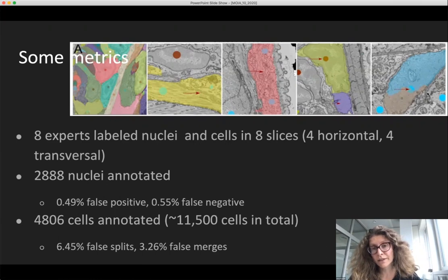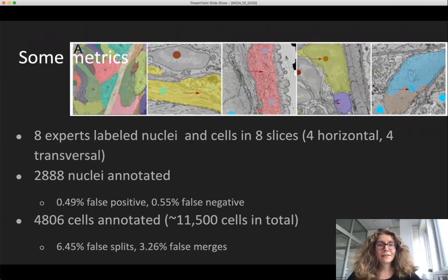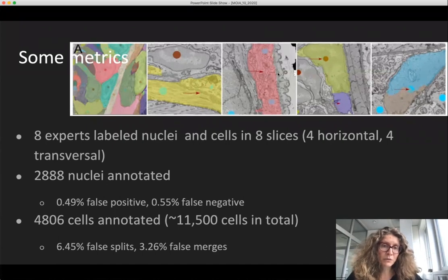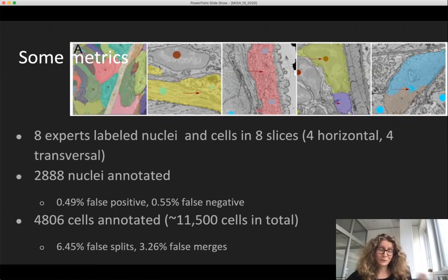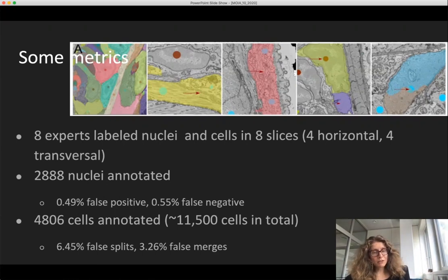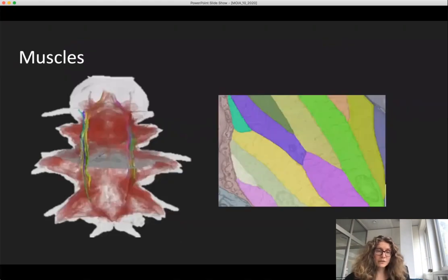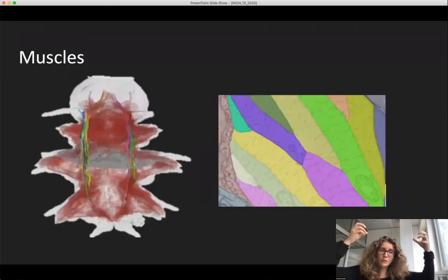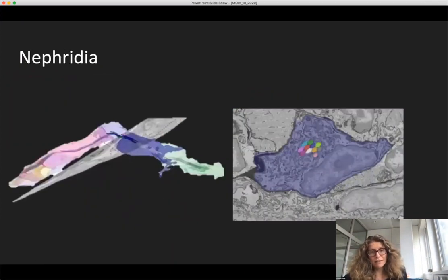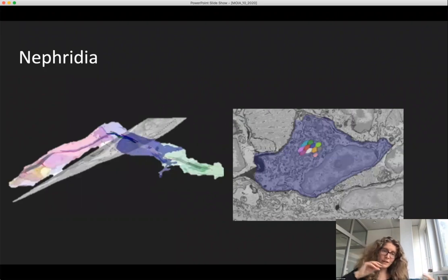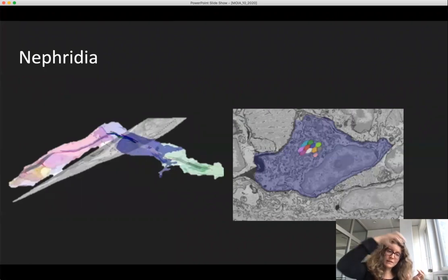Looking at the cell segmentation in more detail: the muscles are very neatly segmented going through the whole animal. You can also look at more sophisticated cells like the nephridia, which have cilia going through all the cells stacked on top of each other. So the segmentation is there.